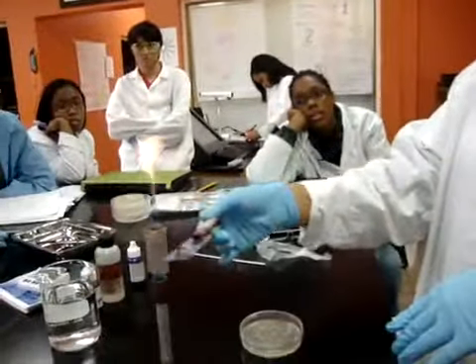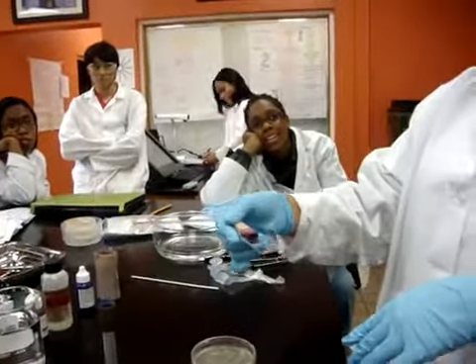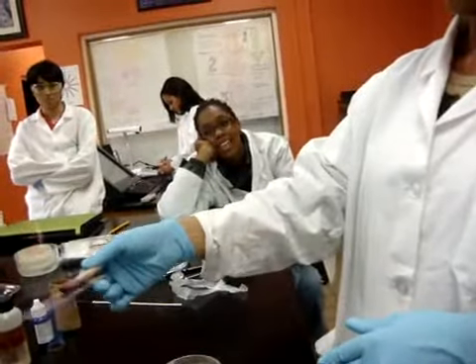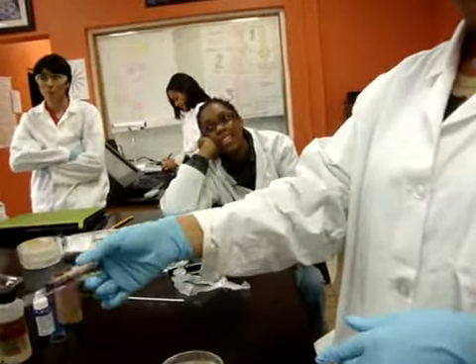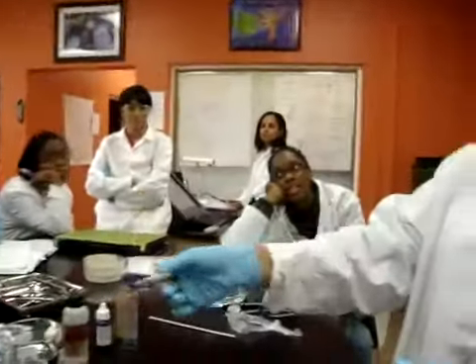So that's not enough to kill the bacteria. Yeah, the bacteria, well, they'll be dead by the time you flame them and put all this stain and alcohol on them. Do we want to see them move around, swim? That's okay. None of these bacteria are swarmers, so you wouldn't see them move anyway.